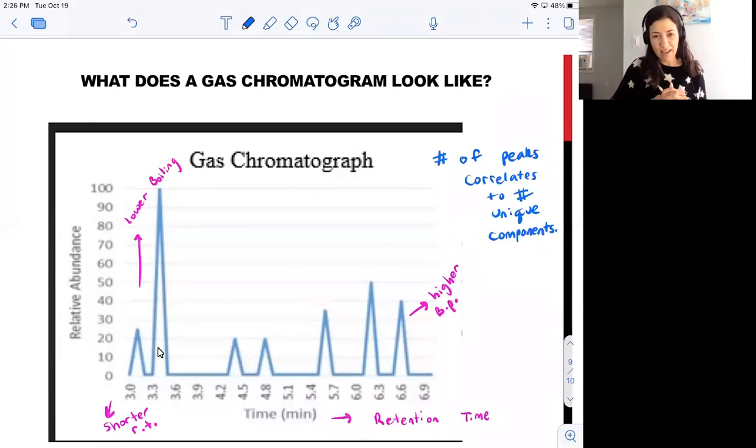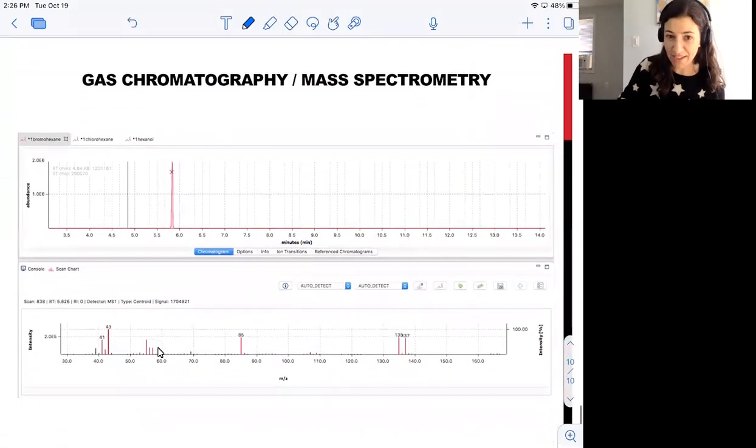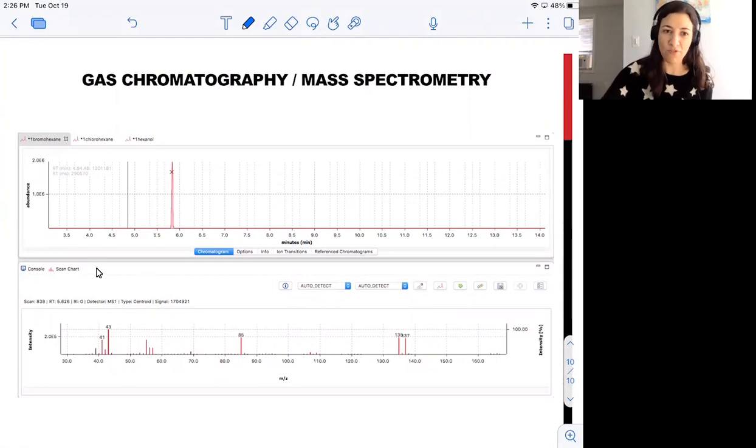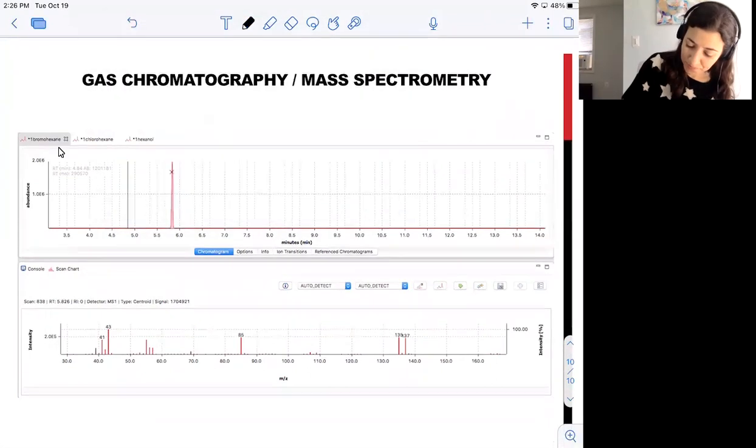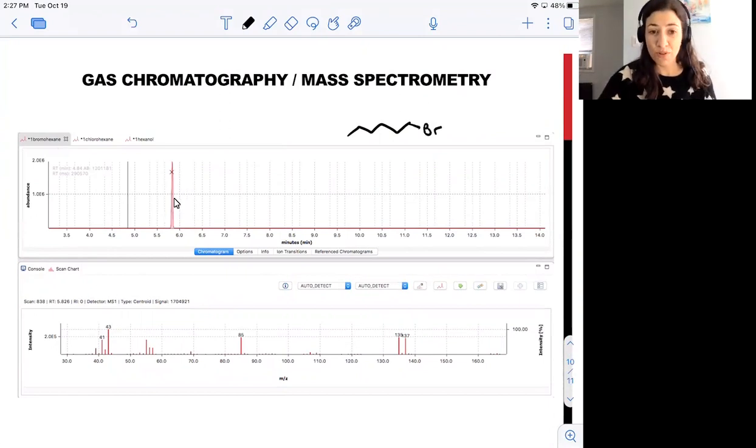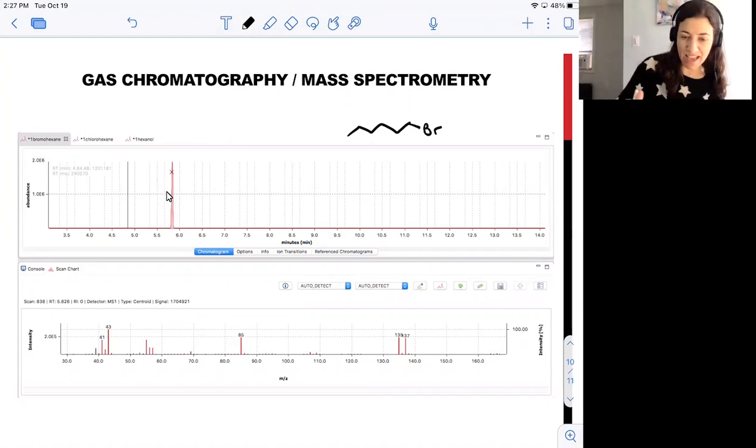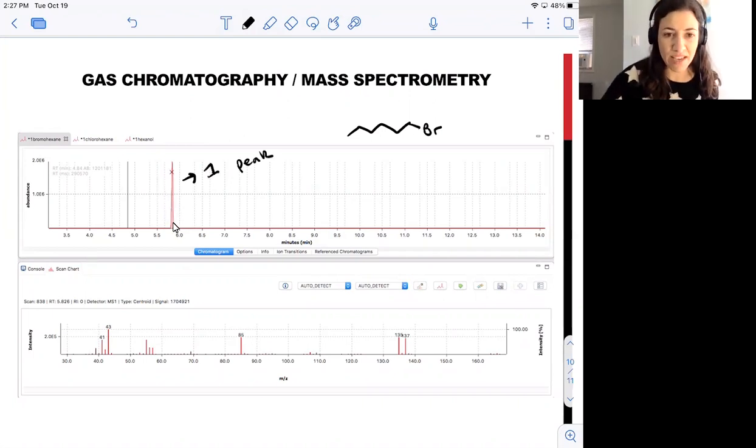On the instrument that we're using in lab with the data analysis software that you'll have access to, even from your own dorm room, your gas chromatogram will look something like this. This is a reference GC for the possible product 1-bromohexane. Because I've used very clean reference material, I am seeing one peak right here in my gas chromatogram. That tells me that my sample is nice and clean. You can see that my retention time is right here between five and a half and six minutes. When you're in the data analysis software, you can get a very accurate retention time for this peak by clicking on it.